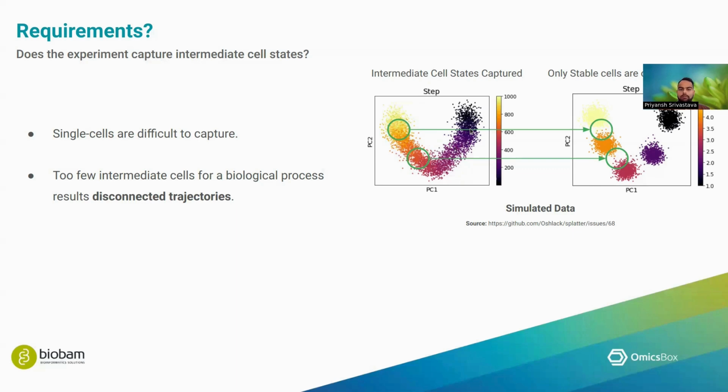But let's say you perform some kind of stringent filtering, or your cells were delicate and most of them died during the sequencing and you removed them. So you ended up having a data set like this where you have spaces in the middle. This is not an ideal case for trajectory inference. Rather, you should choose to do clustering here and try to infer biological insights from that.